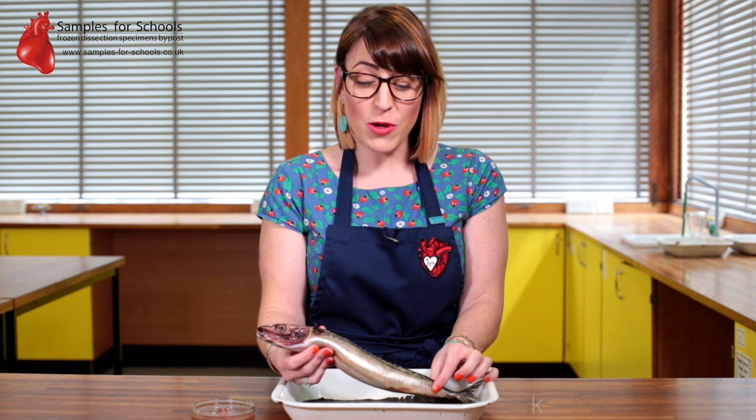Following on from your gill dissection, you can also cut down laterally to explore the skeleton and find the swim bladder. For more ideas, lesson plans and risk assessments, please see our website at www.samplesforschool.co.uk.